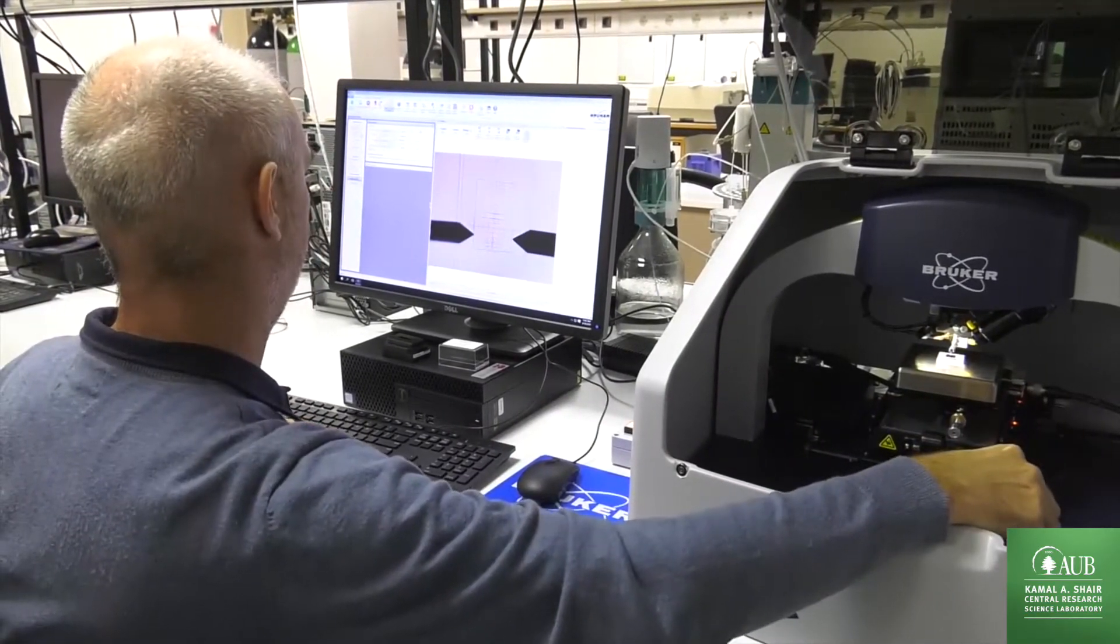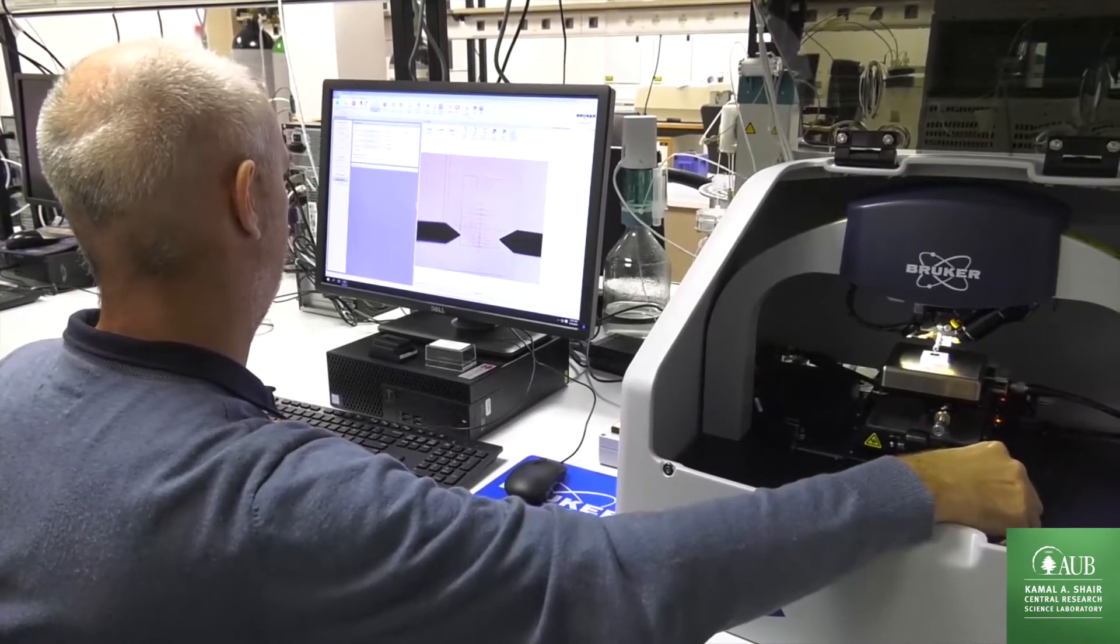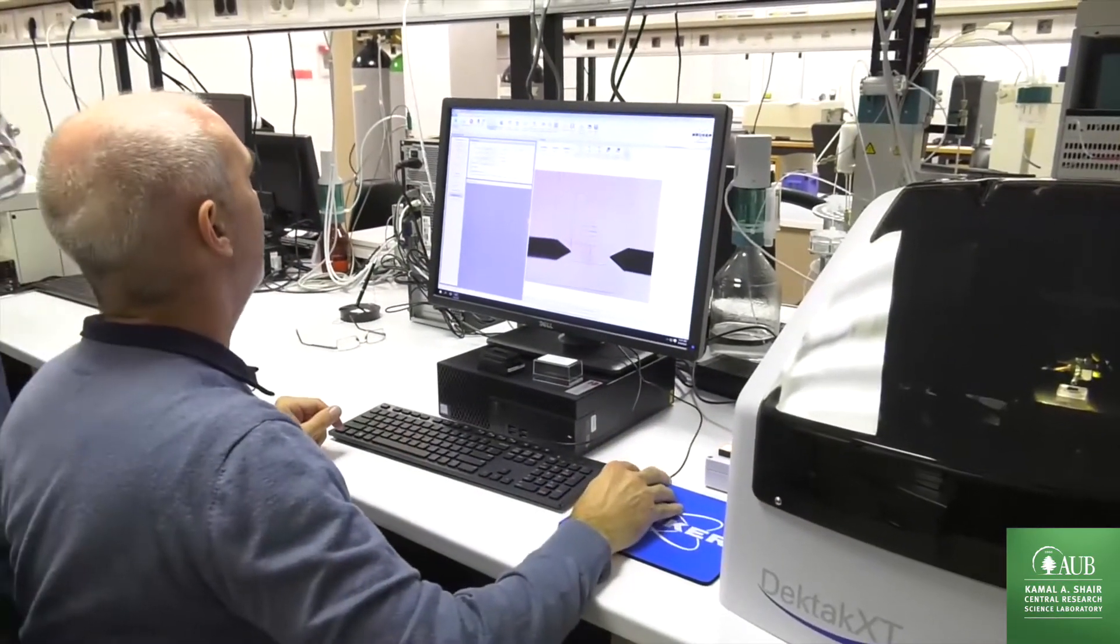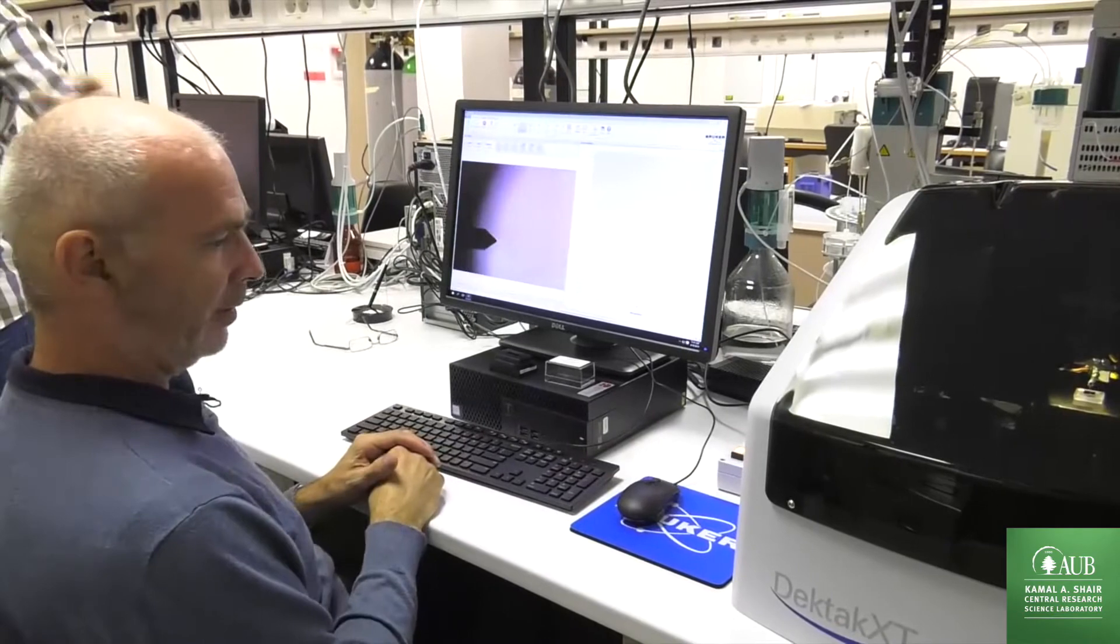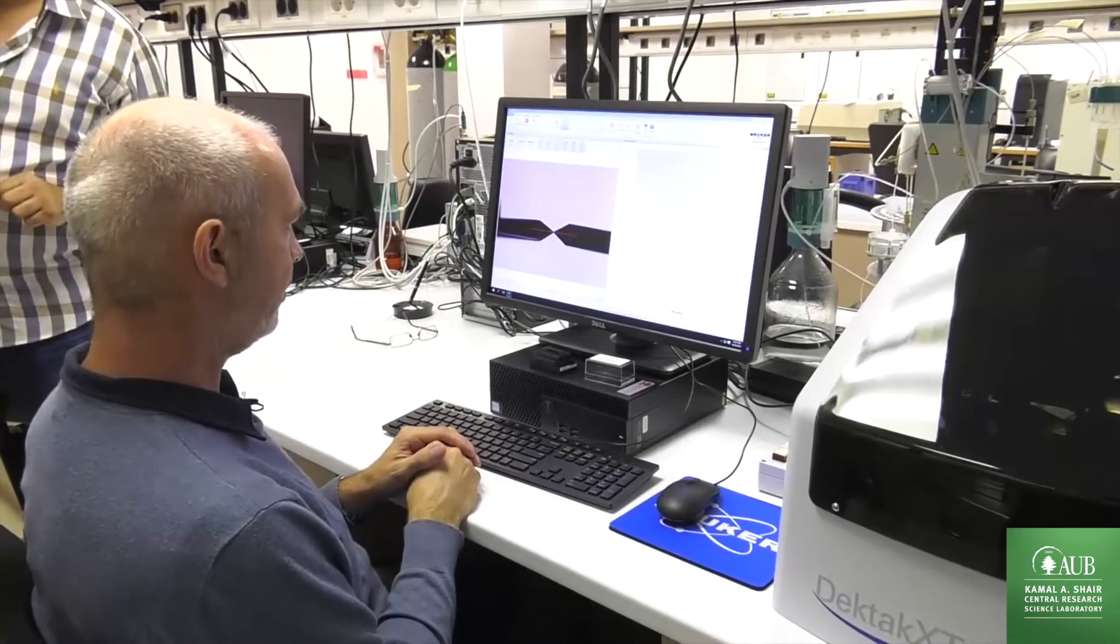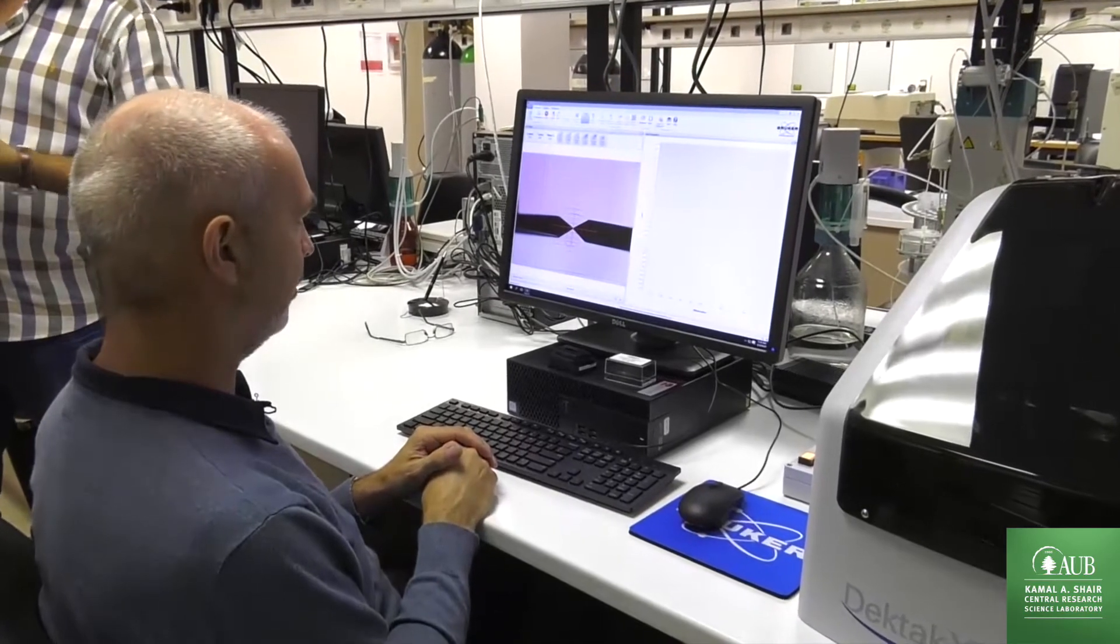Let's draw a little bit, like this. Now the leveling is done, the hardware leveling is done, the rest of leveling we will do with the software.